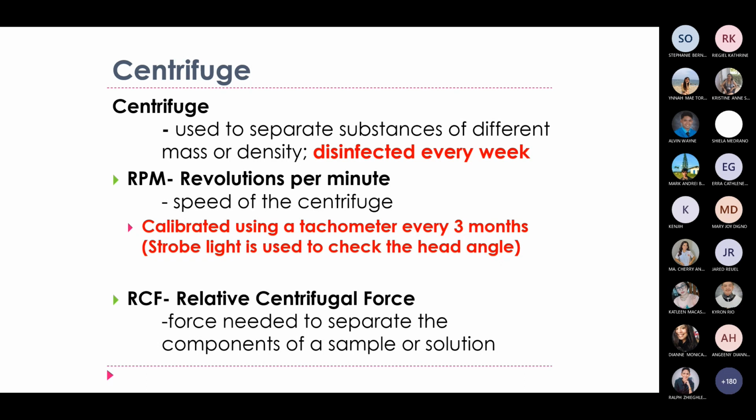Okay. Ano naman yung kinaibahan niya sa relative centrifugal force? So yung RCF, it is the force needed to separate the components of a sample or solution. Yung RPM, yung speed ng centrifuge. But for RCF naman, that is the force needed for the solutions or sample para mag-separate. And may isa pang term si RCF. Ano kaya sa tingin nyo yun, class?